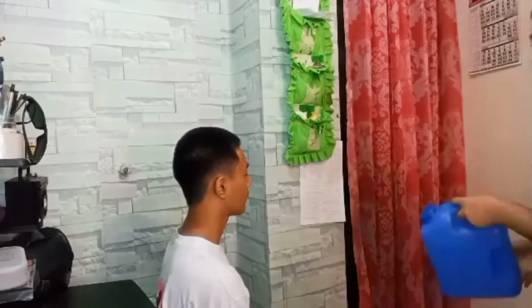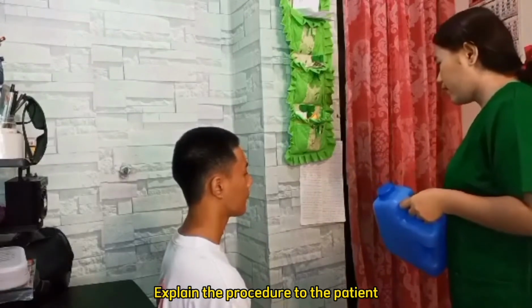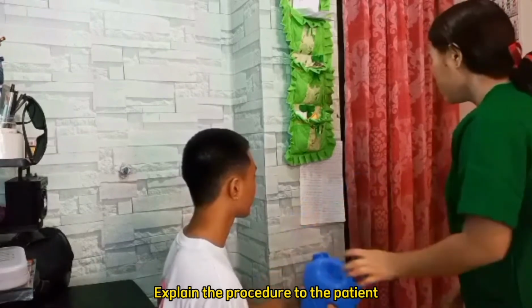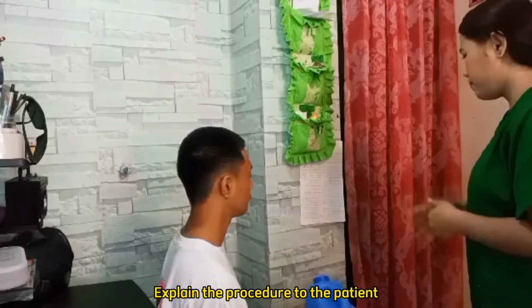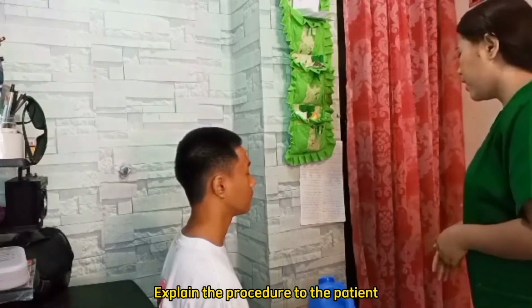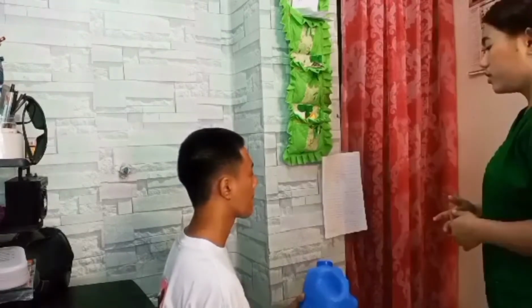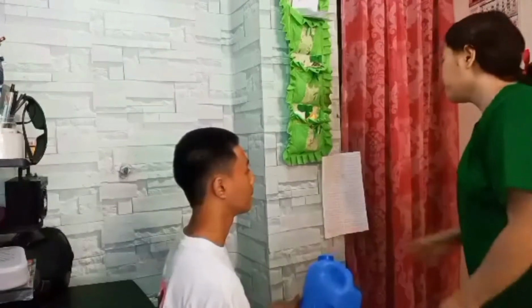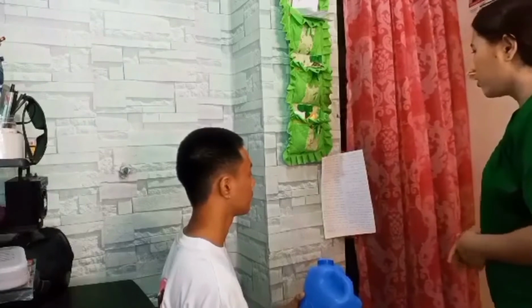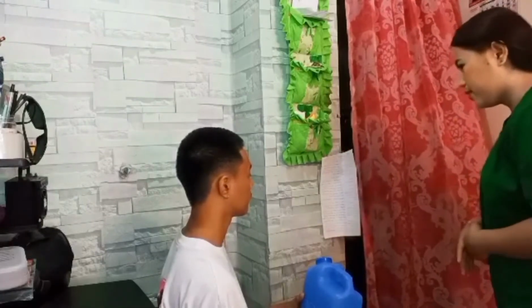Okay, so the first thing that I want to do is just give you this container. By the way, it has your name on it already. So in the first morning, when you're collecting the specimen, what you're going to do is to just urinate into the toilet, and then from that time on, we're going to start the collection. Take note of the collection time here, okay? For the first 24 hours, you're going to urinate into that container. Are you comfortable with that?